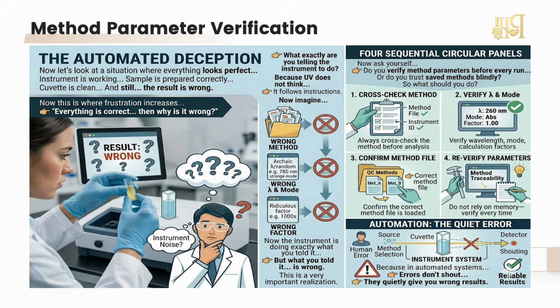So what should you do? Always cross-check the method before analysis. Verify wavelength, mode, calculation factors. Confirm the correct method file is loaded. Do not rely on memory. Verify every time, because in automated systems, errors don't shout. They quietly give you the wrong signals.